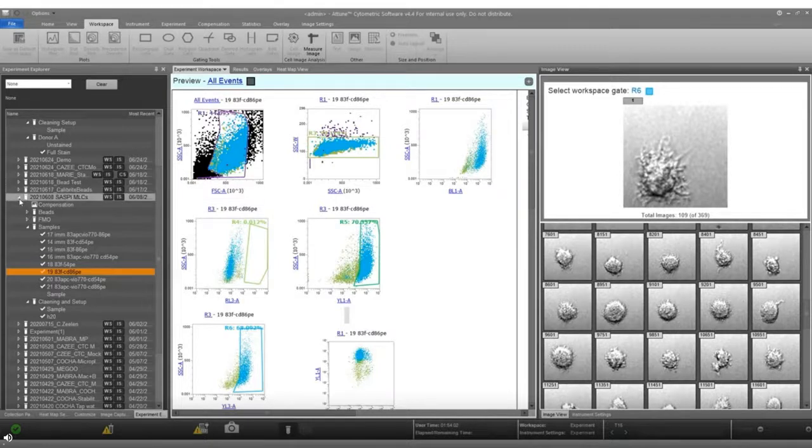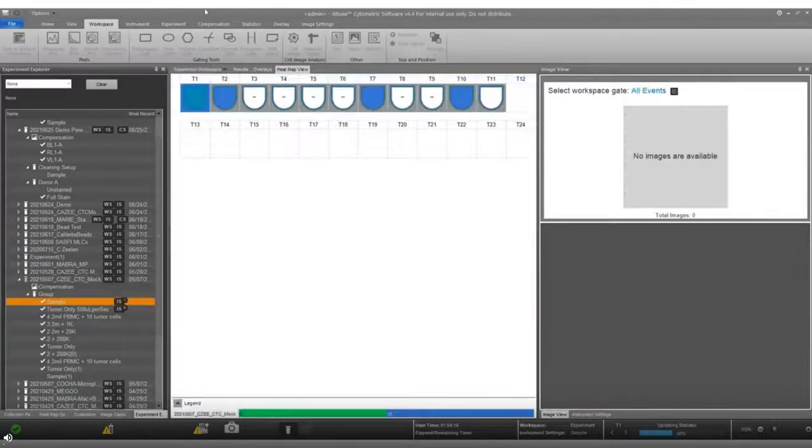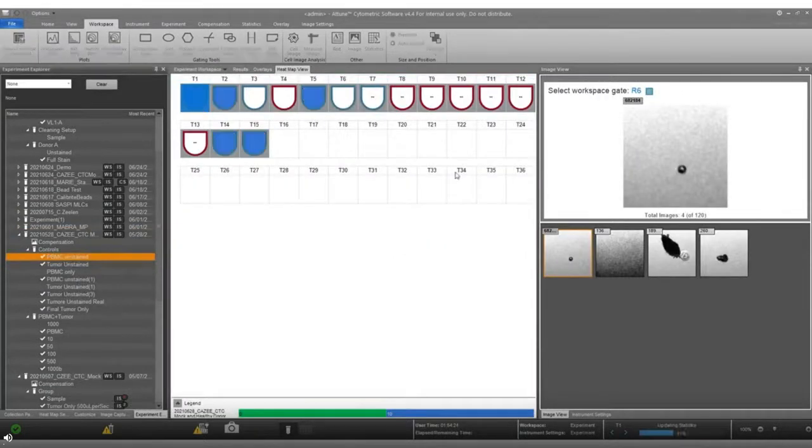And kind of one of the very first things that we thought of doing at the system was looking at really, really rare populations, so really infrequent cell populations. This is the one I wanted to share with you all.